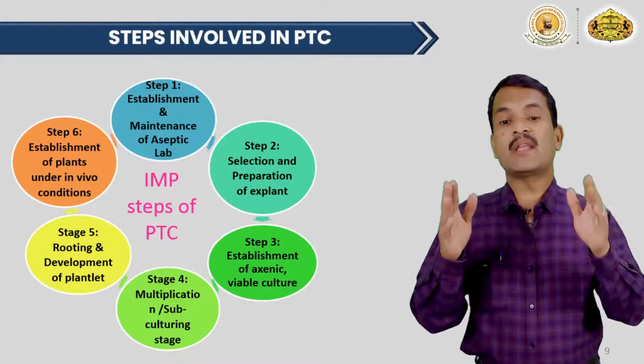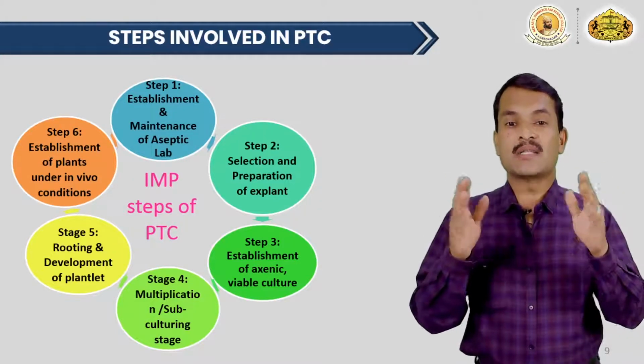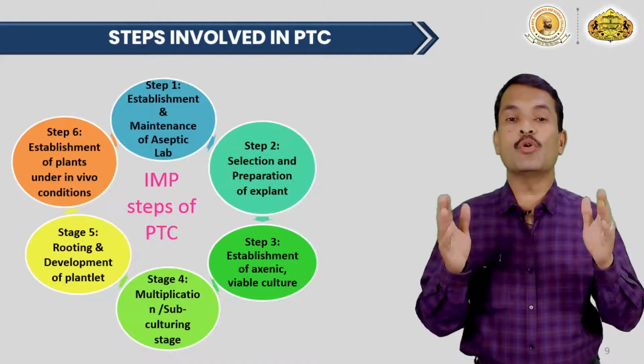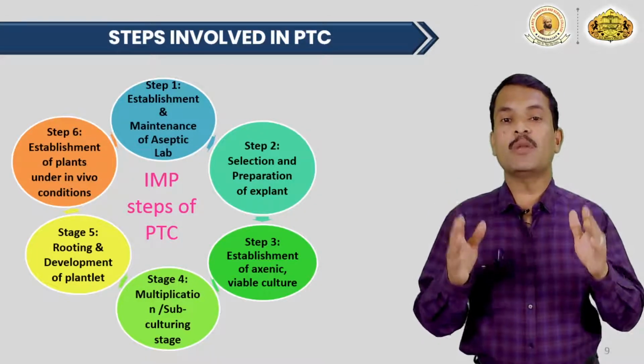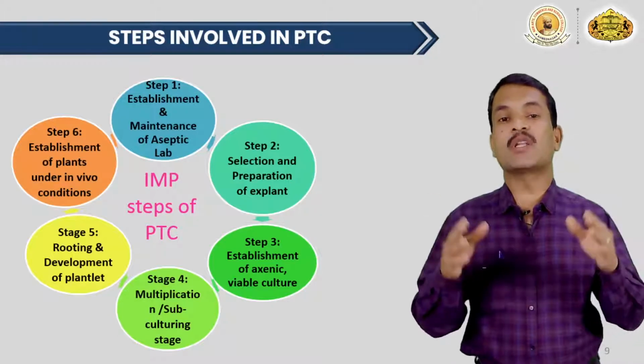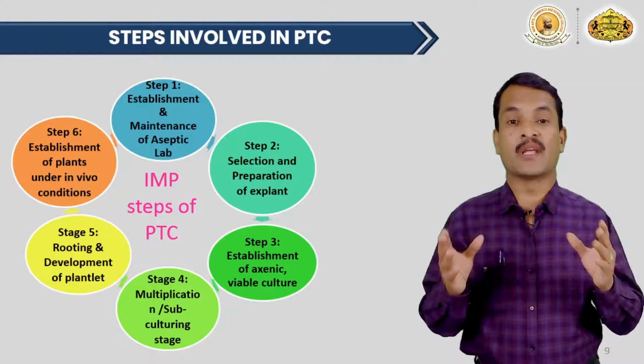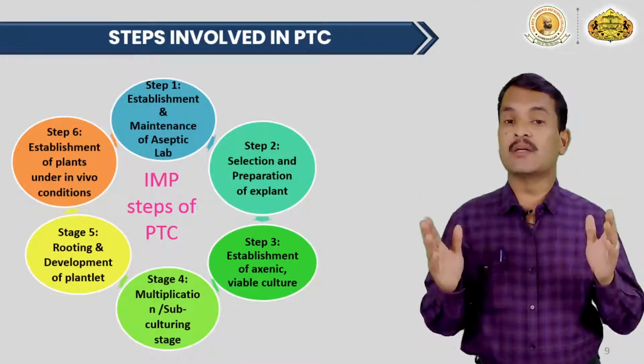And then maintaining the aseptic condition will be of prime importance, because under aseptic condition only you will be able to grow your plant material. Otherwise it will be competed out by the contaminants or the different types of microorganisms which may be present in that particular environment, inside the bottle or inside the laboratory.